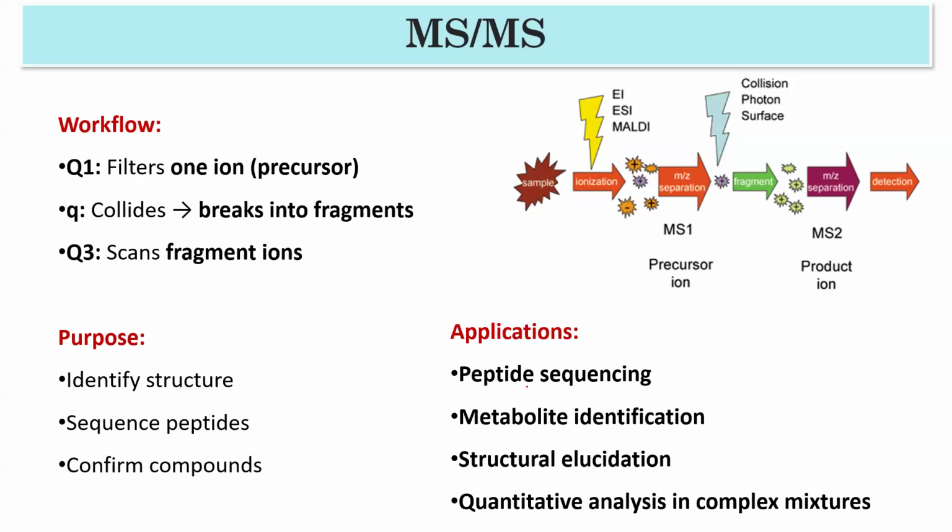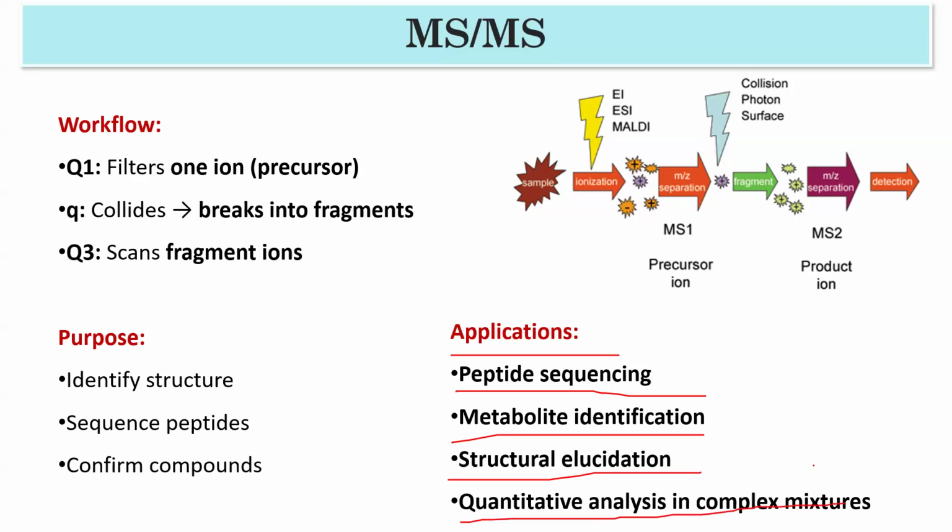So what is the application of MS-MS? You can use it for peptide sequencing, metabolite identification, structure elucidation, and quantitative analysis in complex mixtures.